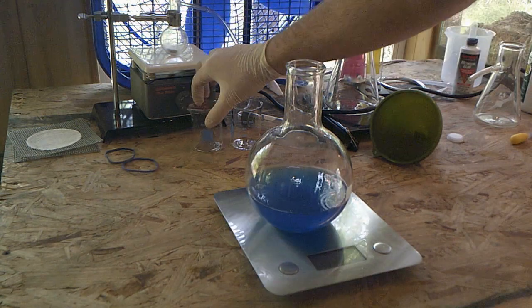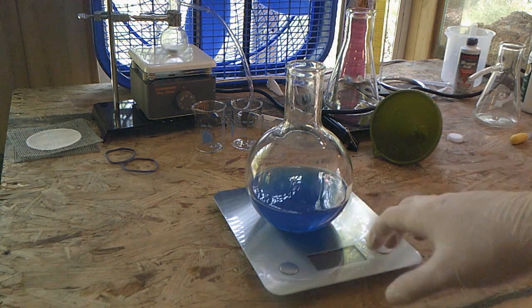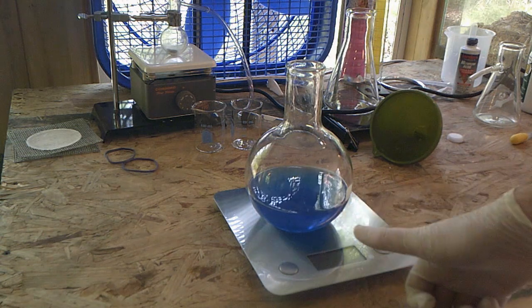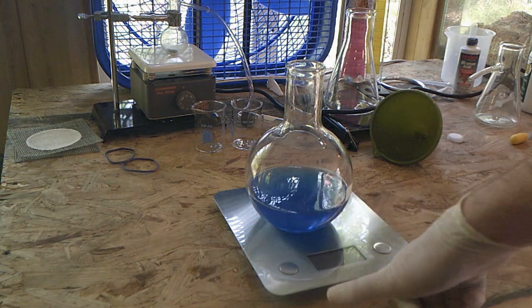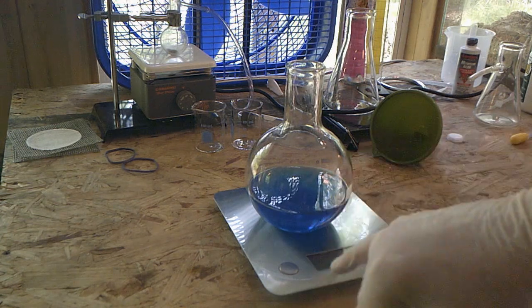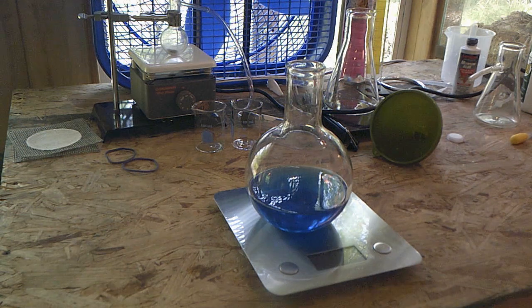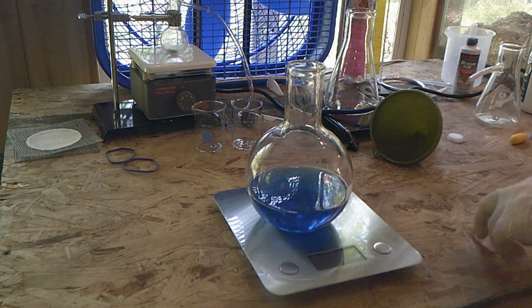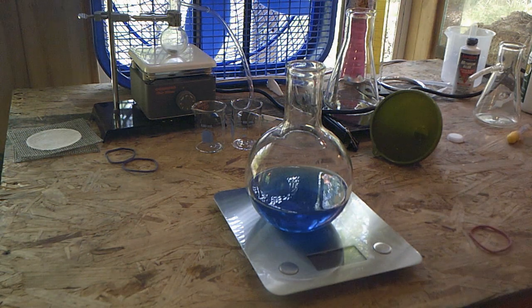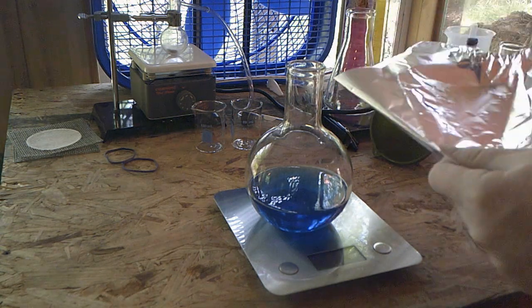All right. So now we have 3 different chemical compounds in here in solution. We have methylene blue in its oxidized form, so when methylene blue is near oxygen, it turns blue. We're going to use the dextrose to take away the oxygen basically and turn it colorless. And that is going to become a colorless liquid in about a minute or 2. Then the other chemicals that we have in here, we have the base, so we have the sodium hydroxide and dextrose or sugar.